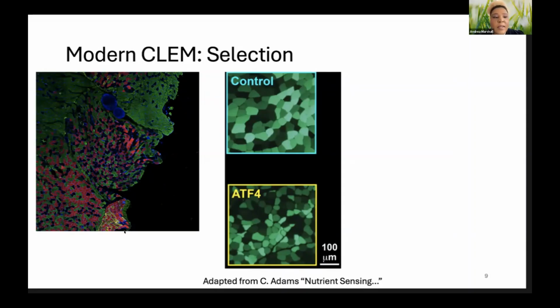And really, one of the things that CLEM would allow, if one is studying muscle and there is a fiber type specific expression pattern in your gene of interest, or if the type of fiber matters, since they do have different mitochondrial counts and different responsiveness and properties that are important to your biological question, is a powerful tool that will allow you to selectively show that the changes of your interest occur in the correct cell type.